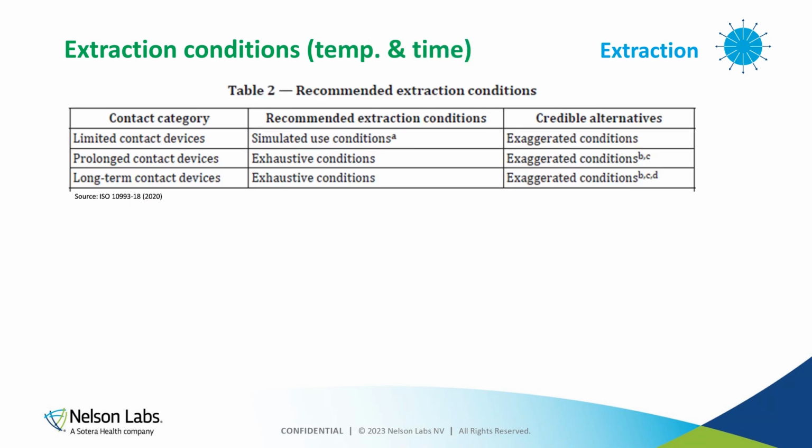Now, which temperatures and times do we use? So therefore, we use table 2 of the 18 standard. And you can see here, depending on contact category of the device, there's simulated use, exaggerated, and exhaustive extraction. Now, for limited contact devices, so less than 24 hours, simulated use conditions are recommended. Now, for prolonged, so more than 24 hours to 30 days, and long-term, more than 30 days, contact devices, exhaustive extraction is recommended.